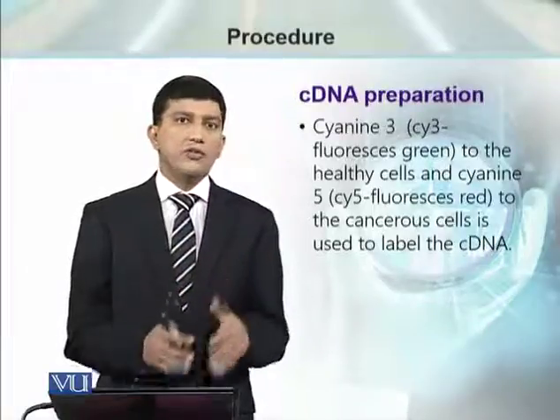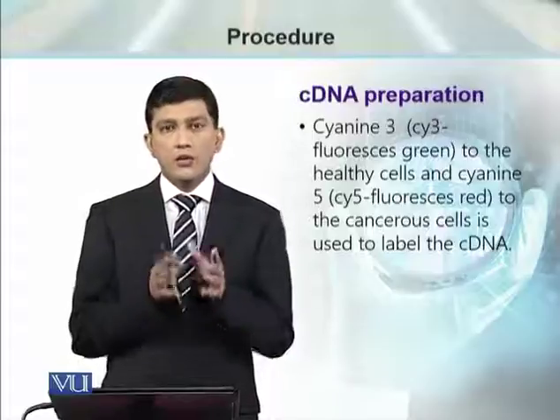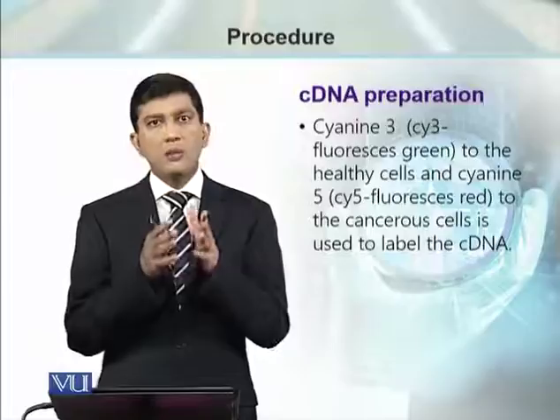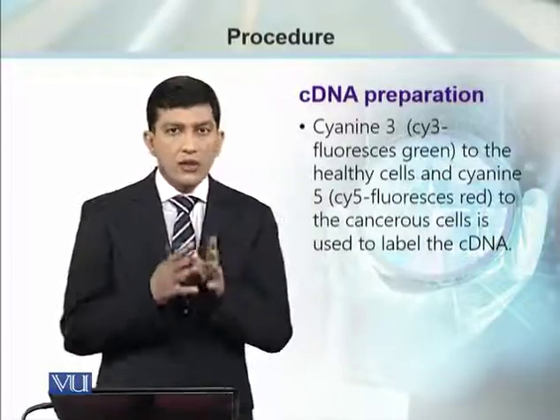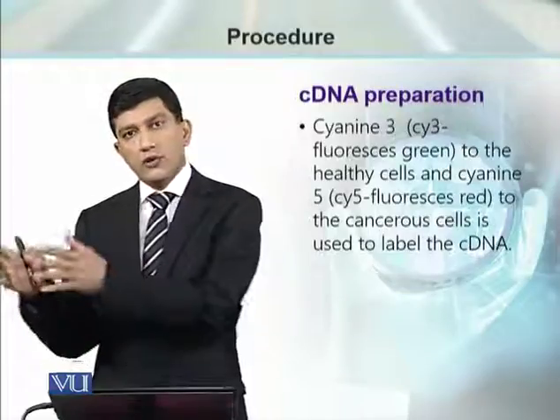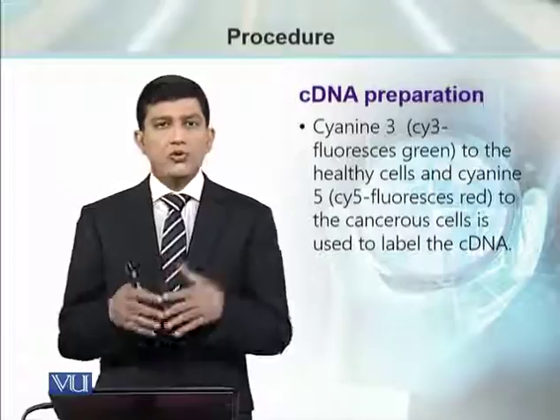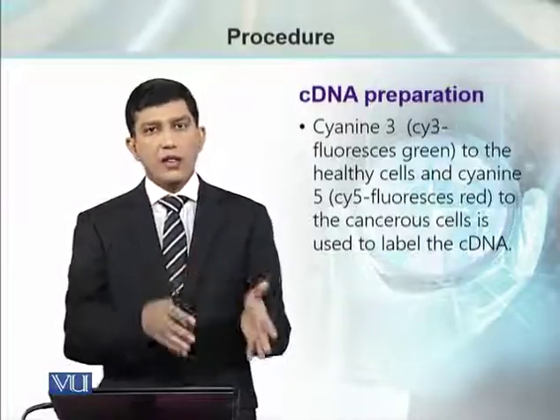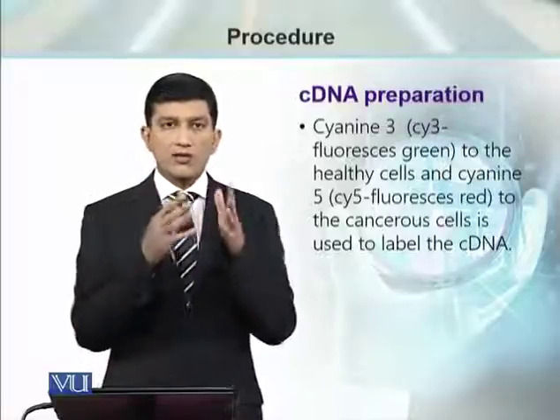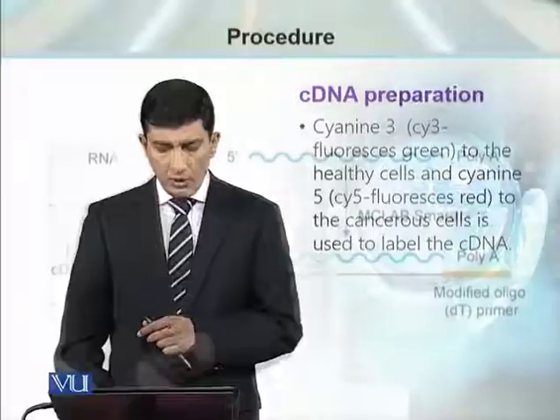है वो कौन सी फ्लोरेसेंस एमिट करेगा, so that at the end we should know that green color is from the messenger RNAs coming from healthy tissue or from an infected sample, and red color is coming from which type of sample, type 1, type 2, जौन सा भी आप उसको nomenclature दें, healthy, diseased, controlled, experimental, sample number 1, sample number 2, whatever is the labeling.